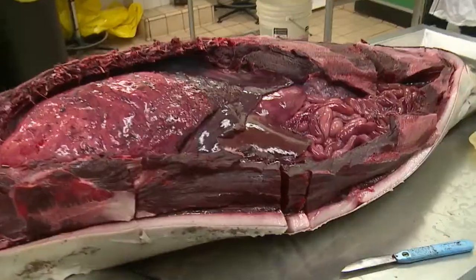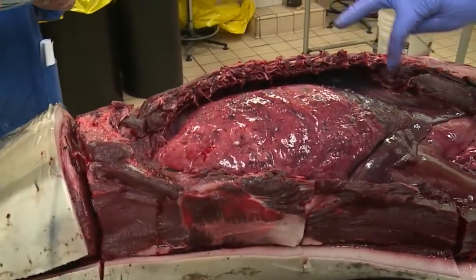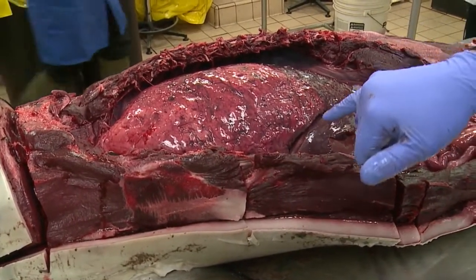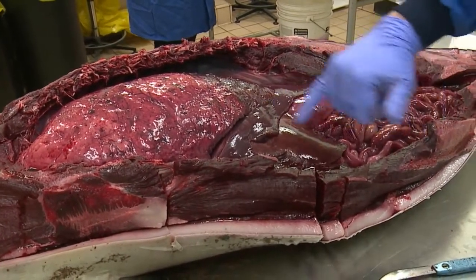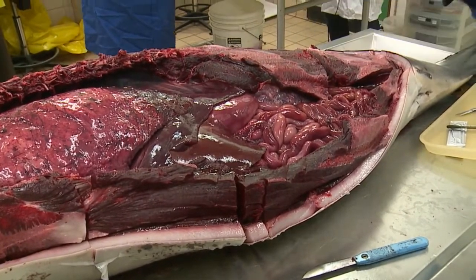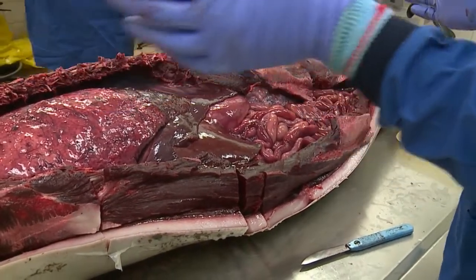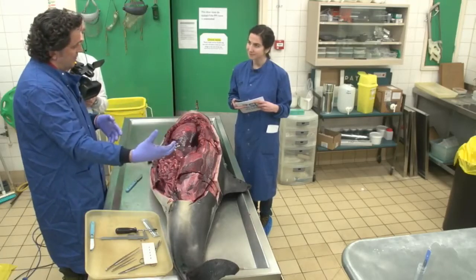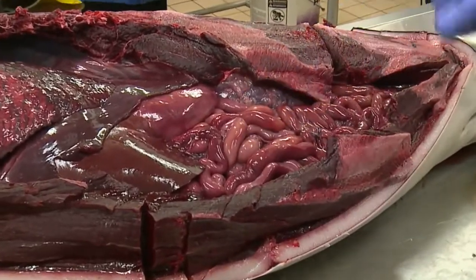What we're looking at now are some of the organs of the animal. So we've got the left lung, lymph node just here. This is the diaphragm, which enables the lungs to inflate, deflate on the surface. Got the liver, we've got the first stomach, because they have three stomach sections. 40 million years ago, the common ancestor diverged, some stayed on land and became things like cattle, and some became cetaceans. So cattle have four stomachs, dolphins have three. Got the kidney just here, and then the long intestinal tract.